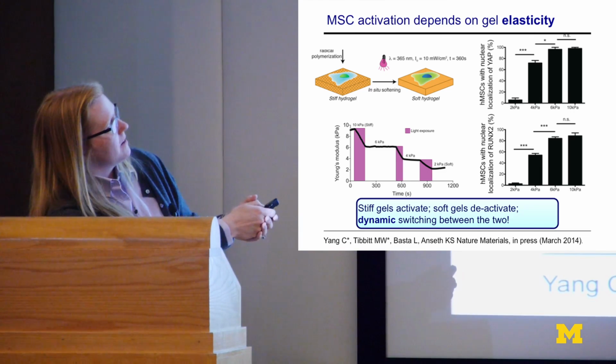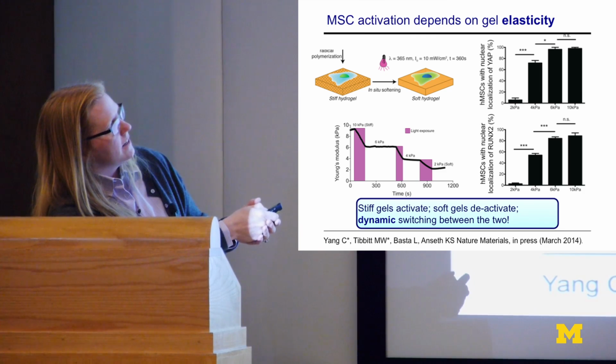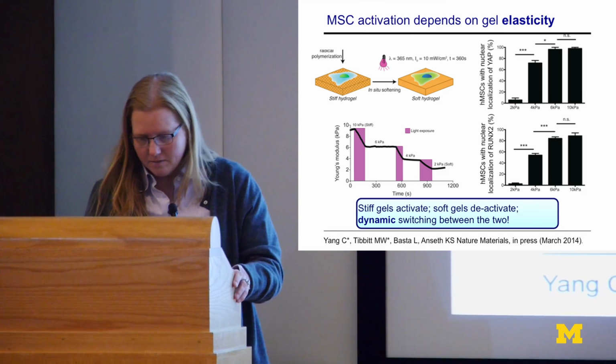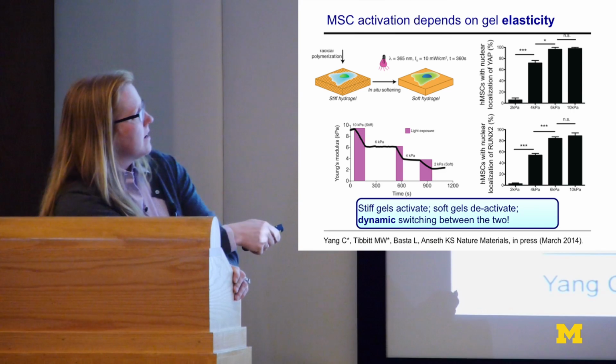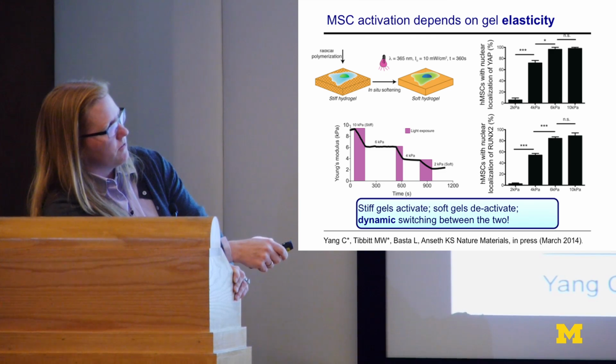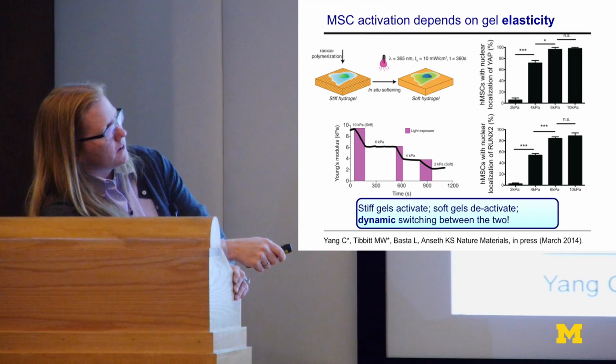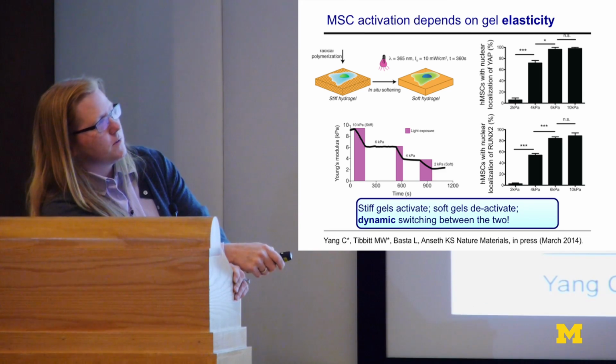So here's the experiment. We're going to culture cells just for 1 day on these stiff environments and then soften. And let's look just here. In the stiff environment, they express this osteogenic transcription factor. And then if we soften it, what happens is it reverses back, and that goes away from the nucleus.